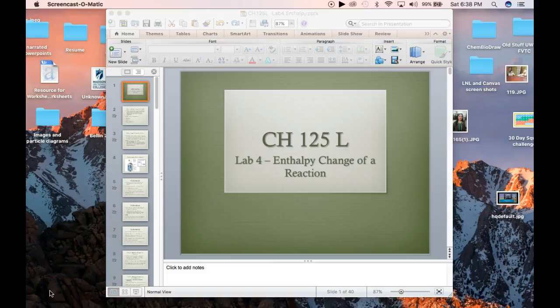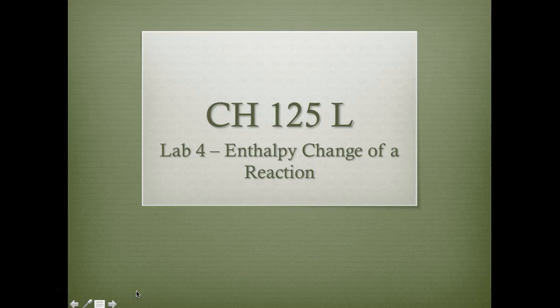In this video, we're going to be discussing Lab 4, which is the enthalpy change or the heat change of a reaction. Okay, so you're going to be doing a lot of heat measurements here. So heat is a type of energy. The word enthalpy in chemistry simply is another way to call heat energy. So enthalpy is heat energy, specifically the heat generated from a reaction.